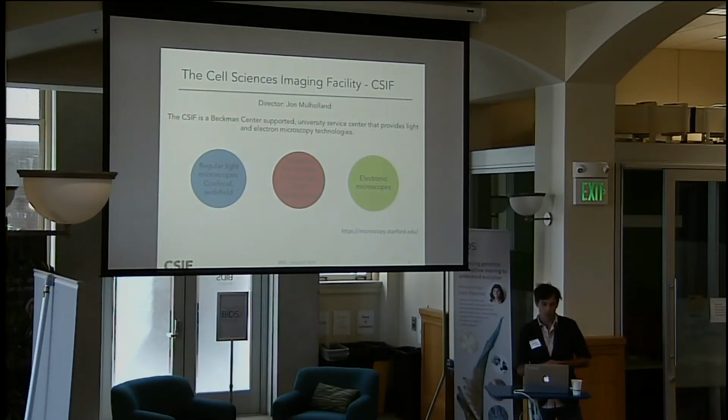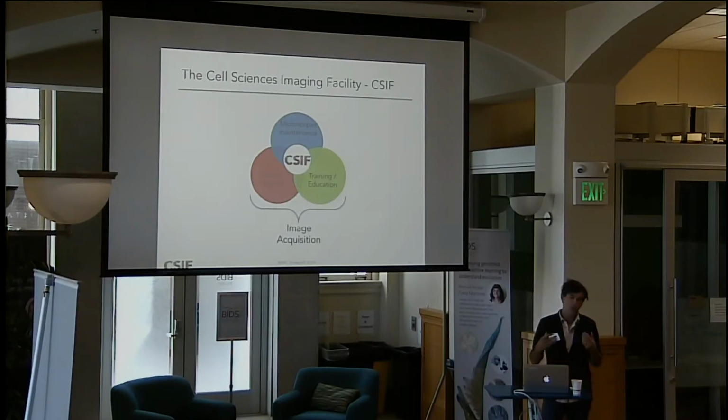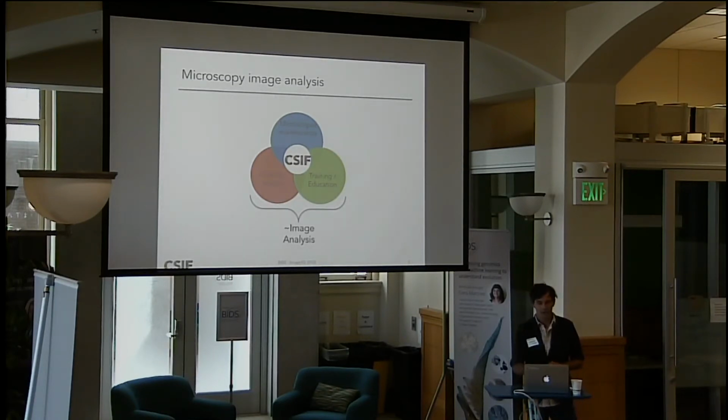And we have some electron microscopes. If you're interested, you can go to our website to see the type of techniques we have. We are a service center, so we take care of the microscopes. We also provide consultation, advice, training, and education on how to acquire images and how to use a microscope. And more recently, we have started to help with image analysis, which was lacking at Stanford.